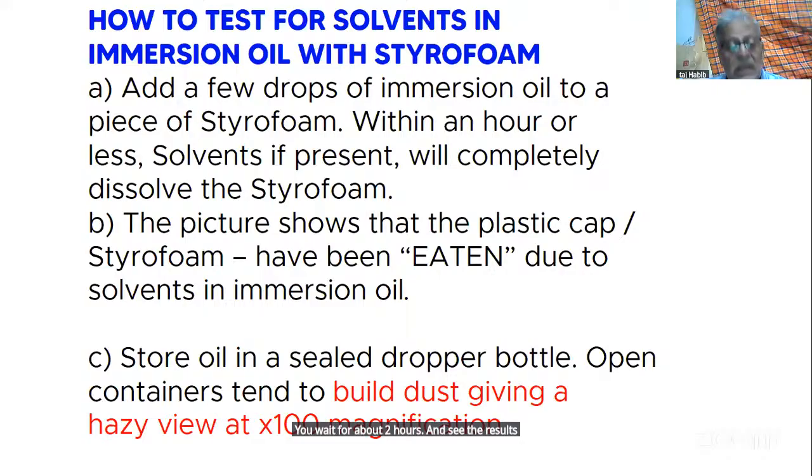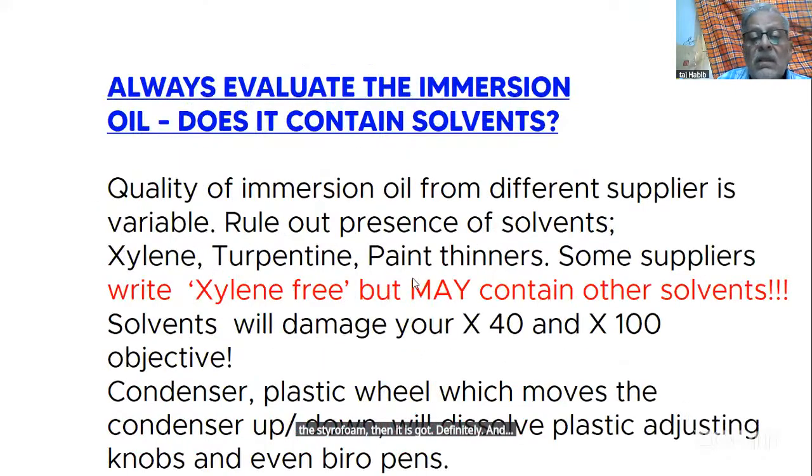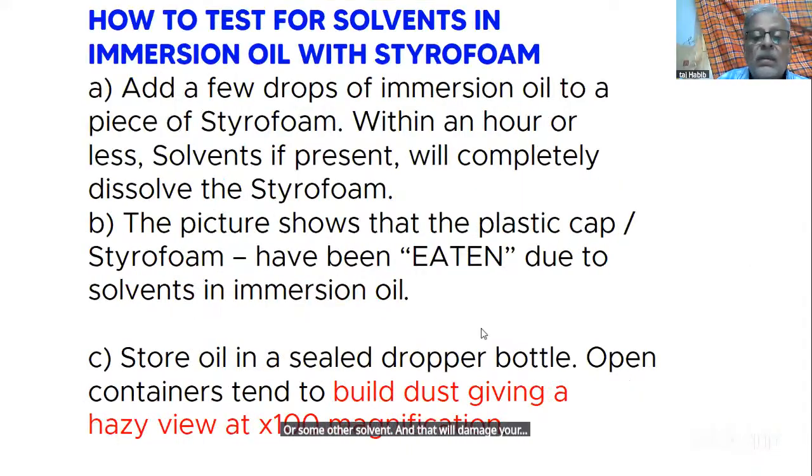If it has eaten the styrofoam, then it definitely contains a substance which is called paint thinner or some other solvent, and that will damage your times 100.